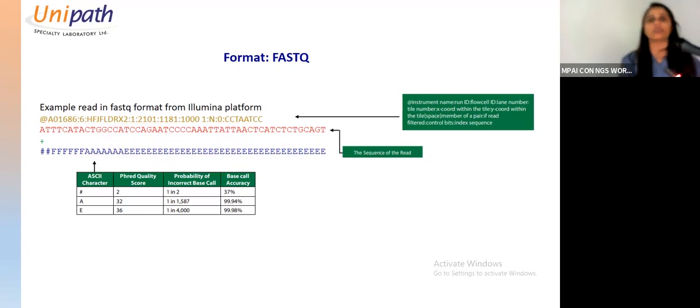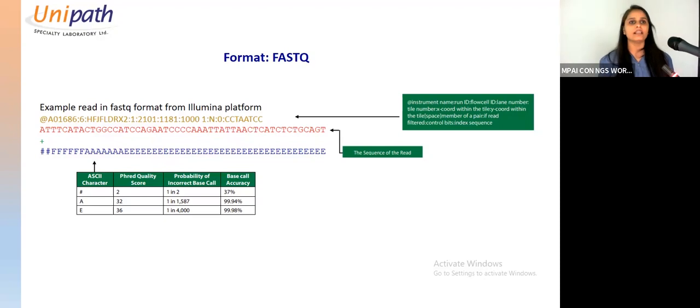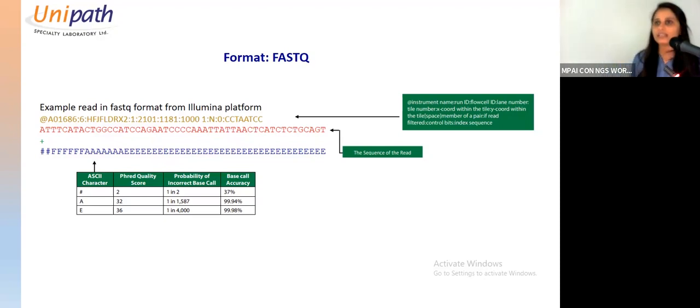Now quality, though it seems like it is alphanumerical, actually represents numbers 1 to 40. If you see Phred encoding, you'll see that this quality represents 1 to 40, though it is alphabet and special symbols. It has been converted like this just to reduce the size of the file, nothing else.